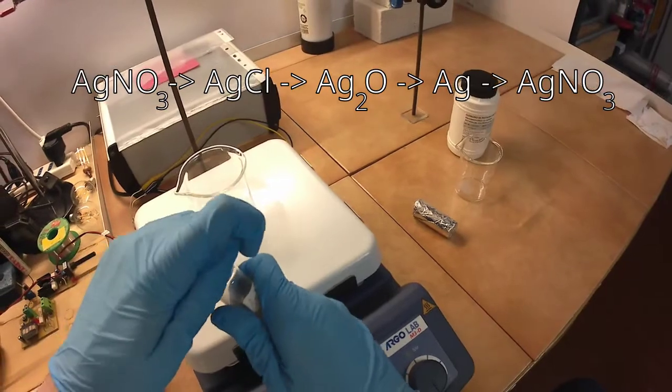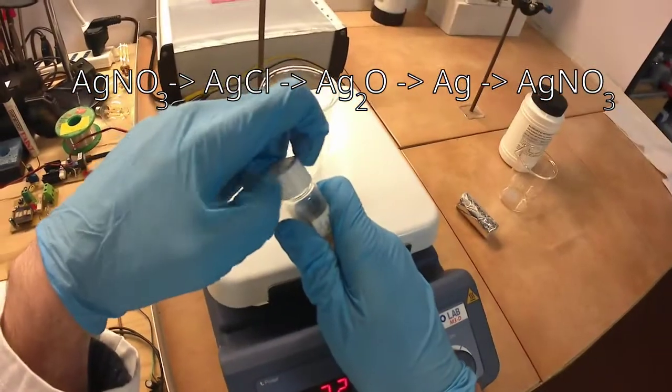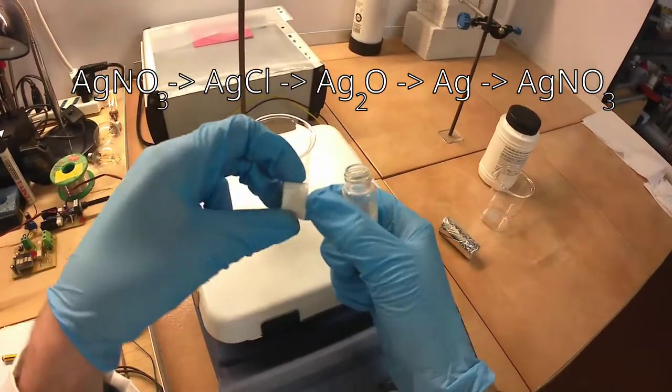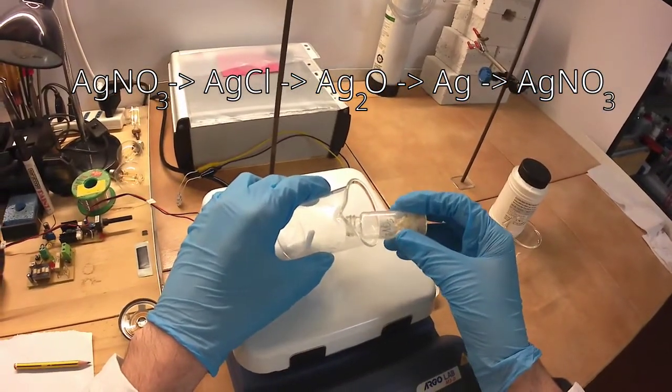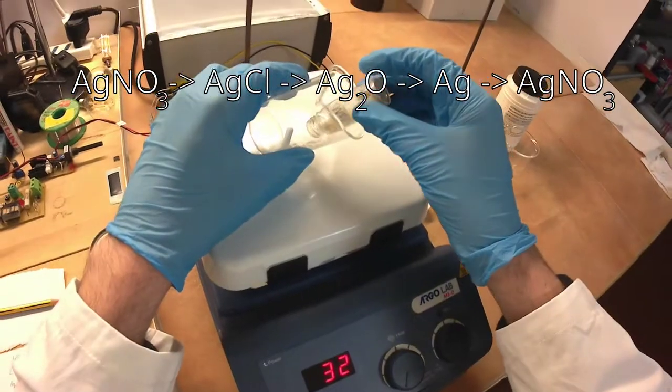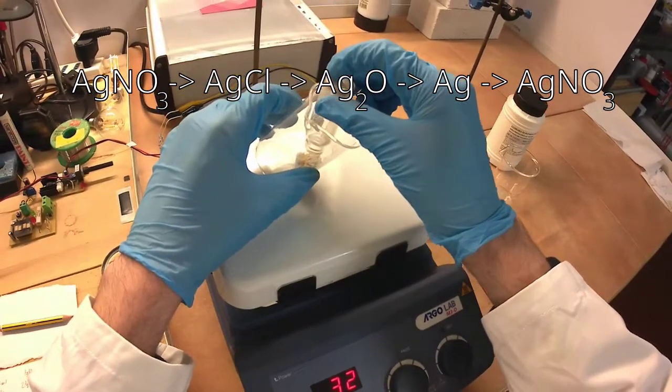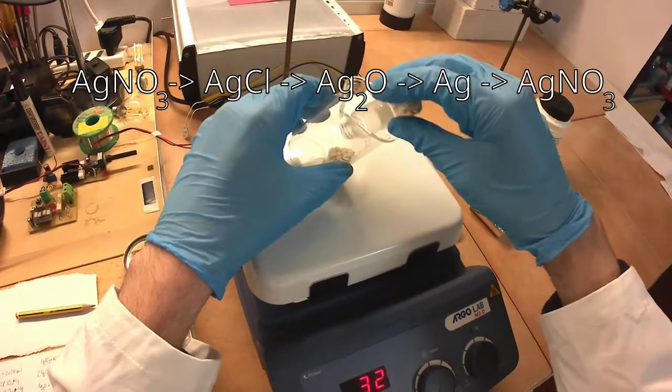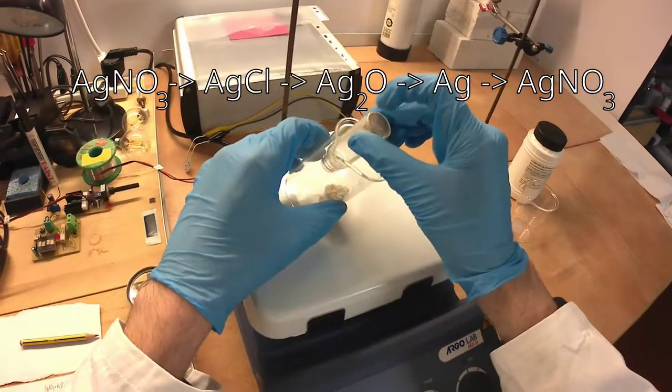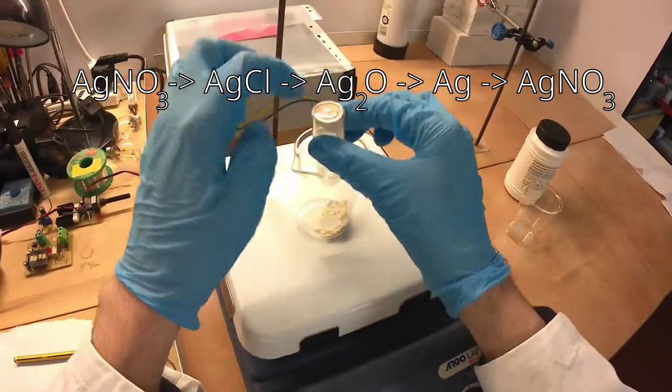There are many reducing agents that will work. Formaldehyde is known to work, some reducing sugars are known to work as well. However, I happen to have some vitamin C lying around, which should behave as a reducing agent. So instead of following the known path, today we'll formulate a little research question: Can ascorbic acid reduce silver oxide to silver metal? And try this hypothesis with an experiment.